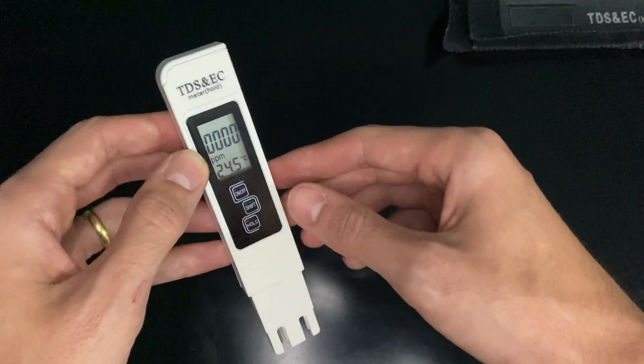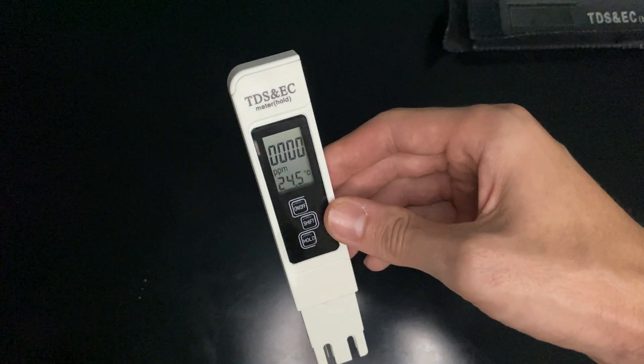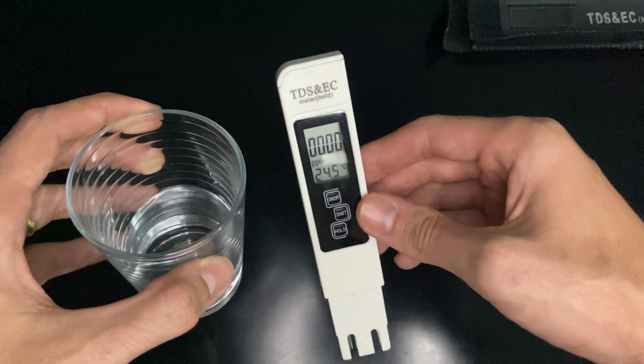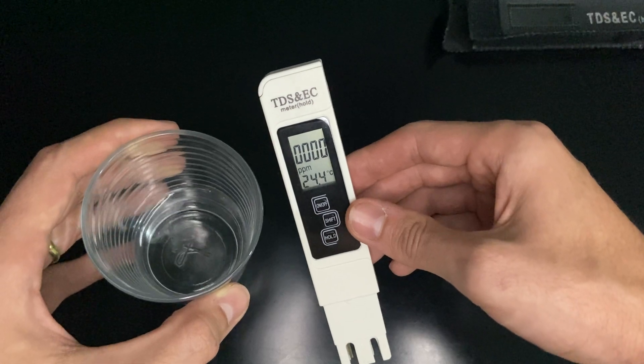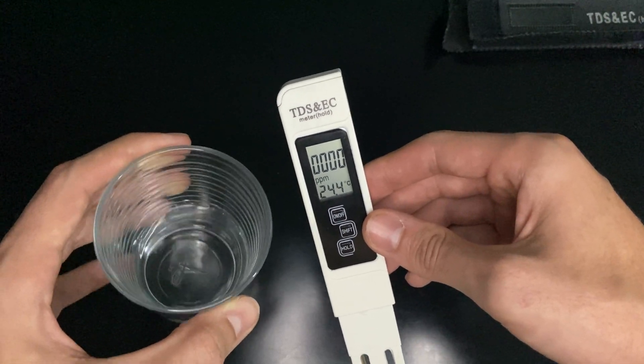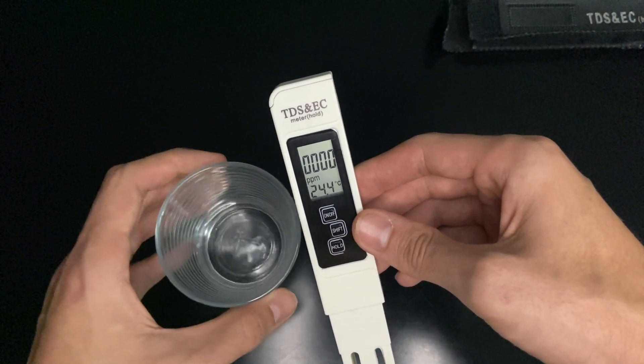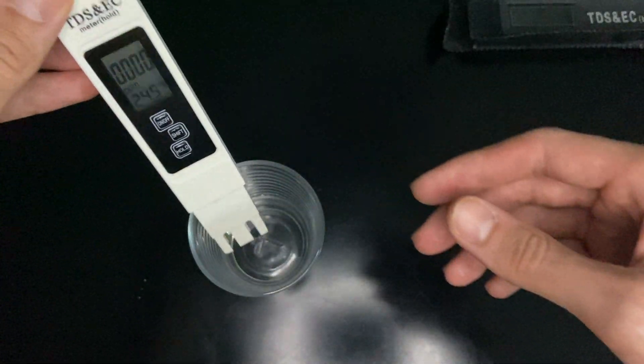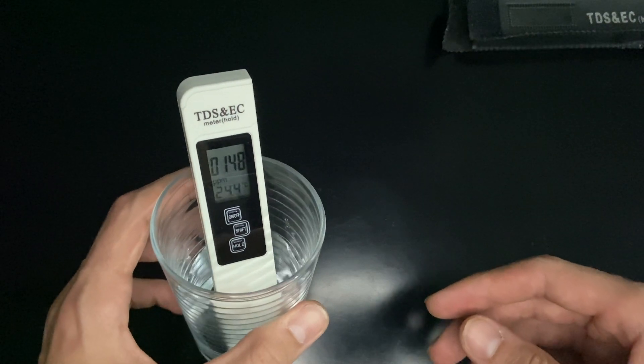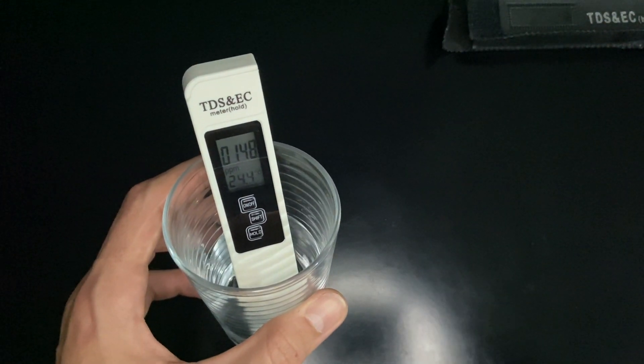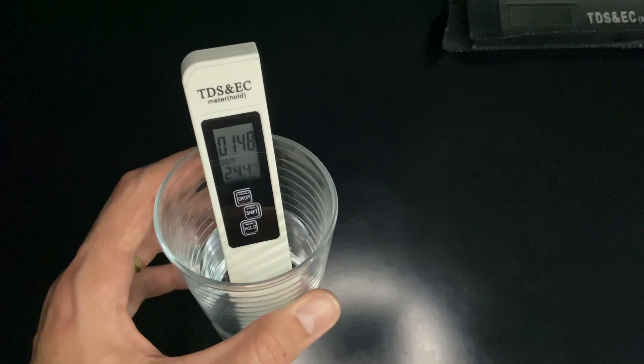Let's try this. Here's a sample from my water filtration system. Let me put it here, and as you can see, the number is 148. We have a scale here that shows the quality of the water.